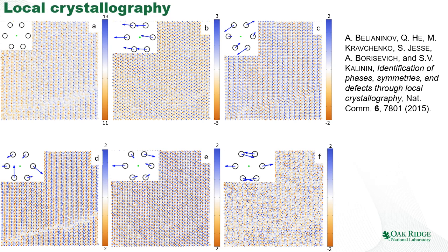So in this case, we take our radio vector, and rather than doing the K-means clustering, which separates atoms into groups, we actually perform the principal component analysis, which tries to find the distortions from the ideal structure and orders these distortions in the sequence of importance. So the most important distortion is just expansion and contraction, so there are just strains inside the system.